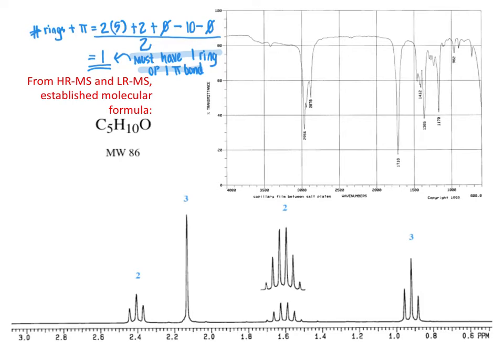Taking a look at the IR spectrum, what you'll want to ask yourself is, do you see any functional groups peeking out at you?